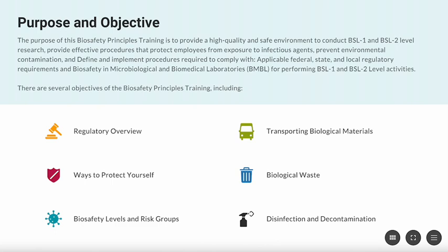There are several objectives of the Biosafety Principles training, including regulatory overview, ways to protect yourself, biosafety levels and risk groups, transporting biological materials, biological waste and disinfection and decontamination.